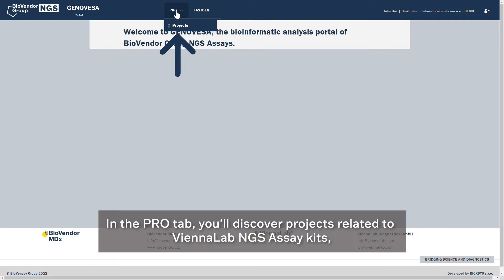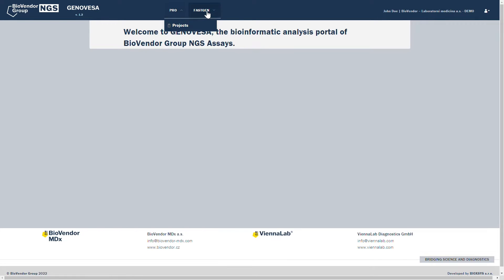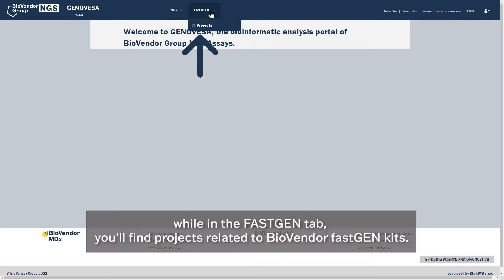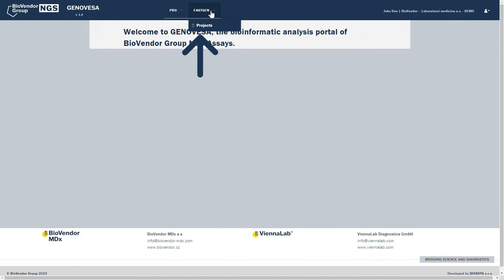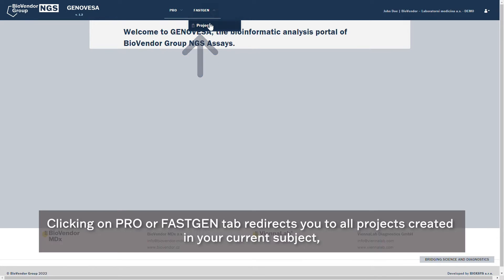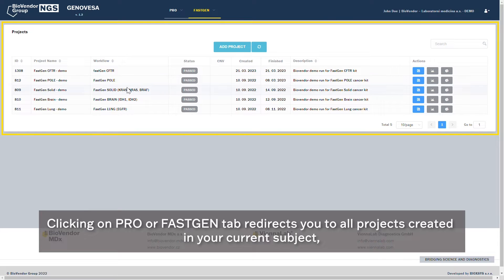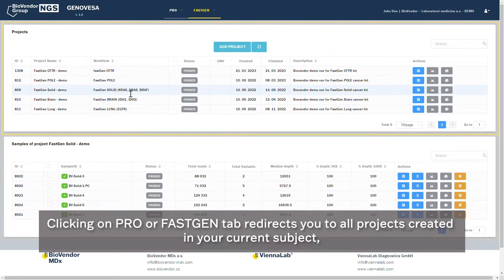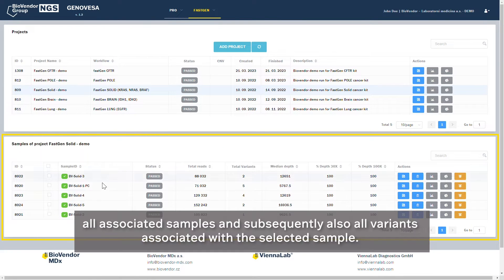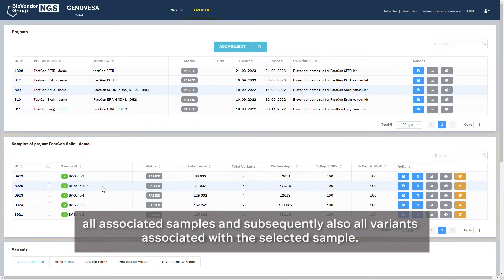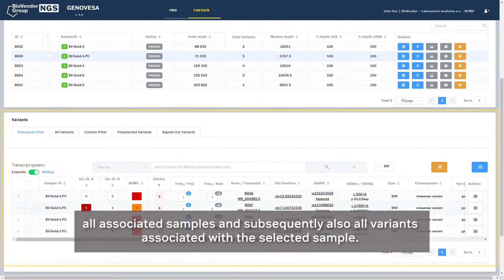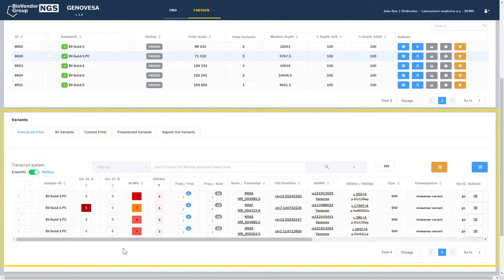In the Pro tab, you'll discover projects related to Vienna Lab NGS Assay Kits, while in the Fast Gen tab, you'll find projects related to BioVendor Fast Gen Kits. Clicking on the Pro or Fast Gen tab redirects you to all projects created in your current subject, all associated samples, and subsequently all variants associated with the selected sample.